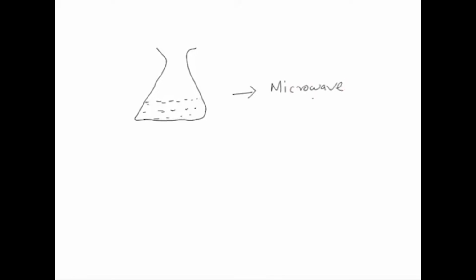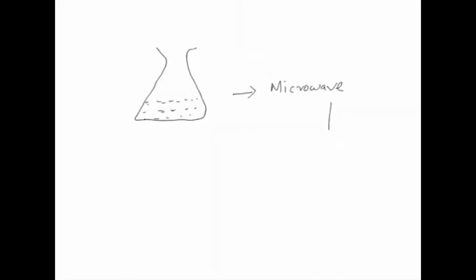So, you have to heat this conical flask, which contains the weighed amount of agarose and the appropriate amount of buffer. Once you put it in the microwave, the agarose will melt and mix properly, and you will see a thick melted solution. After that you cool it for a while, and then you can add ethidium bromide.